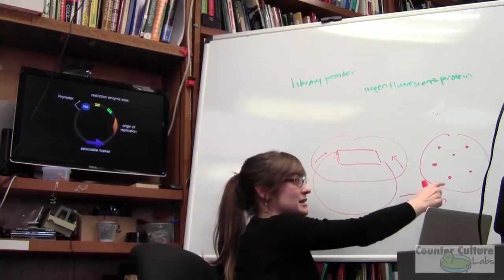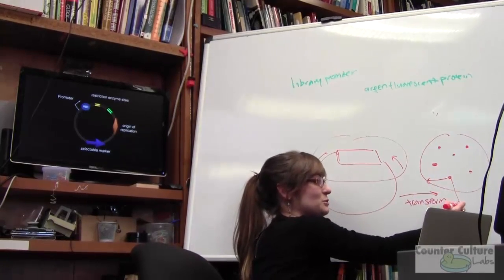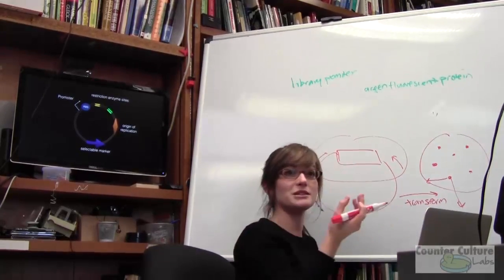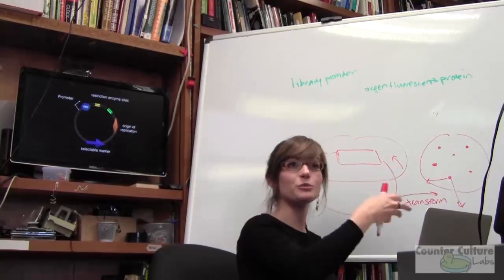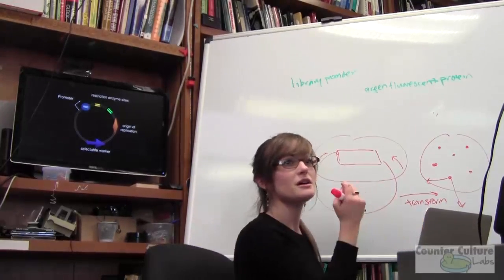And then simultaneously, while you're putting some cells in a tube for PCR, you put some cells in a tube for mini prep. And whichever sequence correctly, you mini prep the DNA, meaning you isolate the plasmid DNA from your cells. So you inoculate a culture from that colony, grow it up, mini prep your DNA, isolate the plasmid, and then you have the plasmid to move forward with.